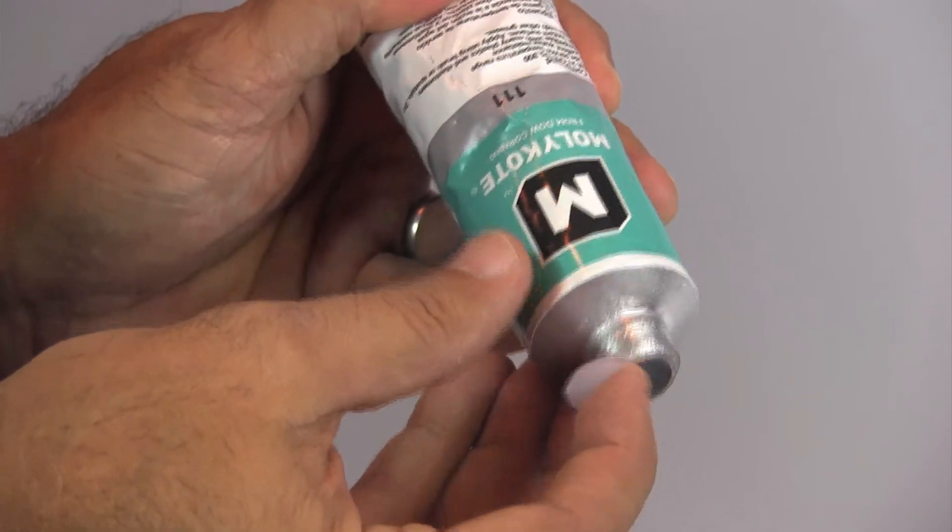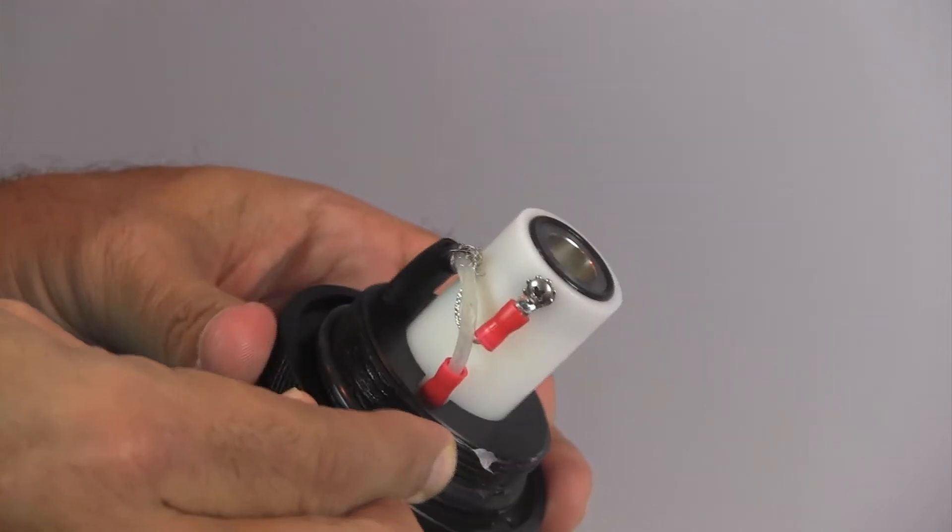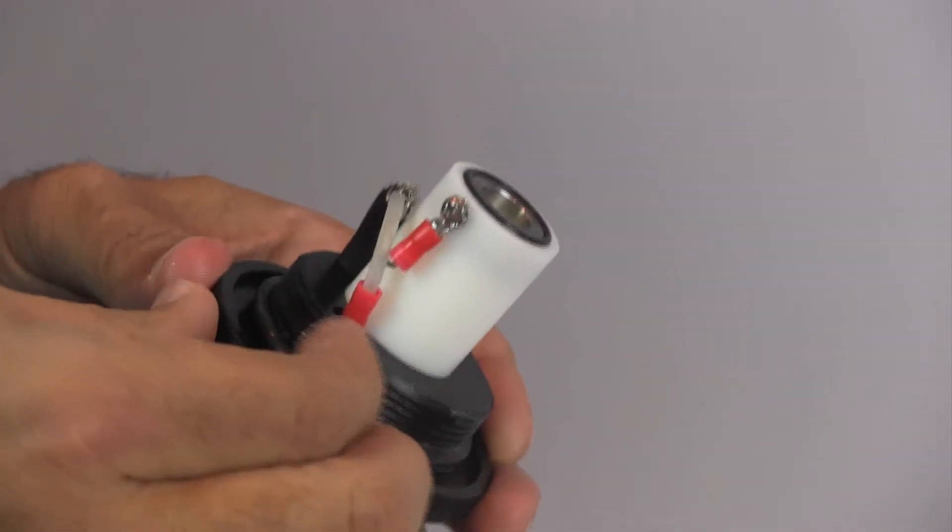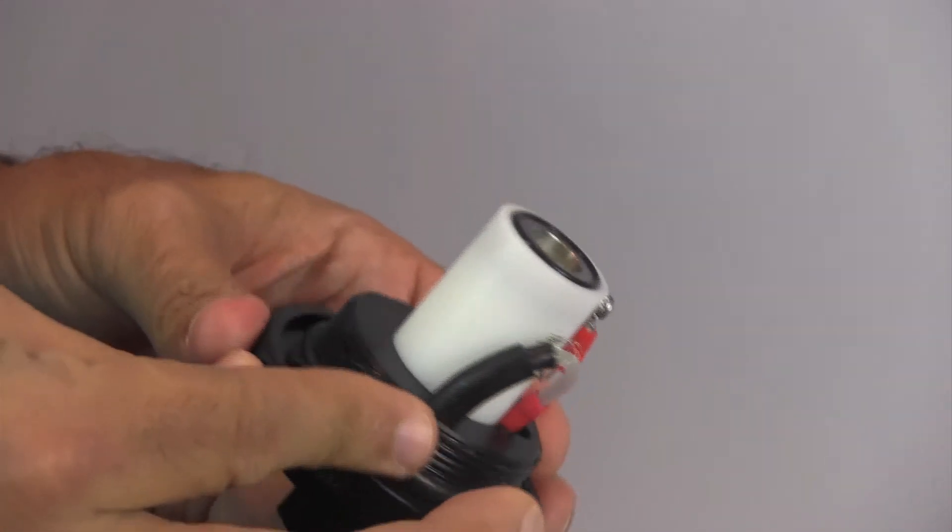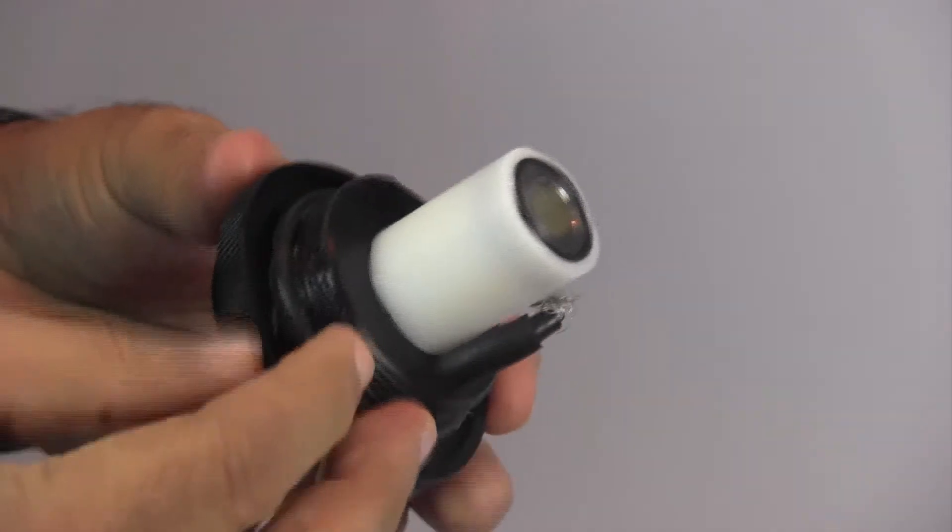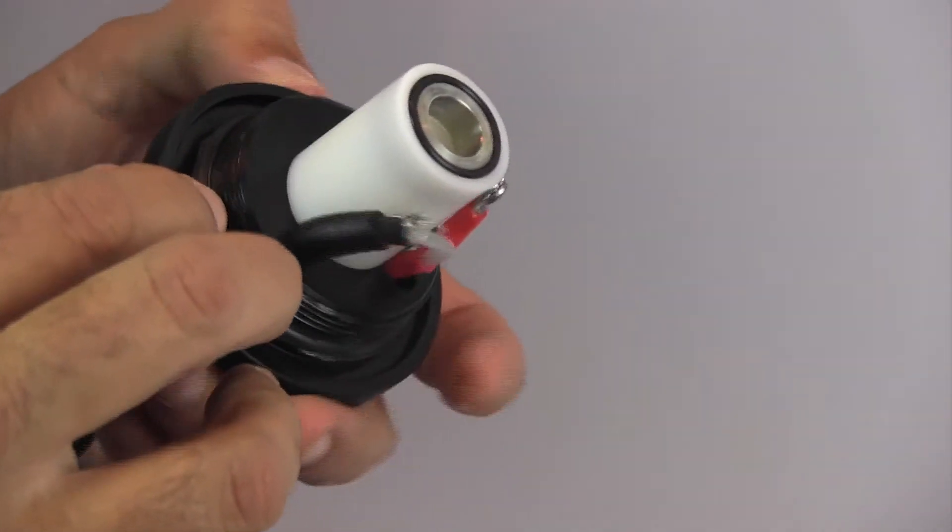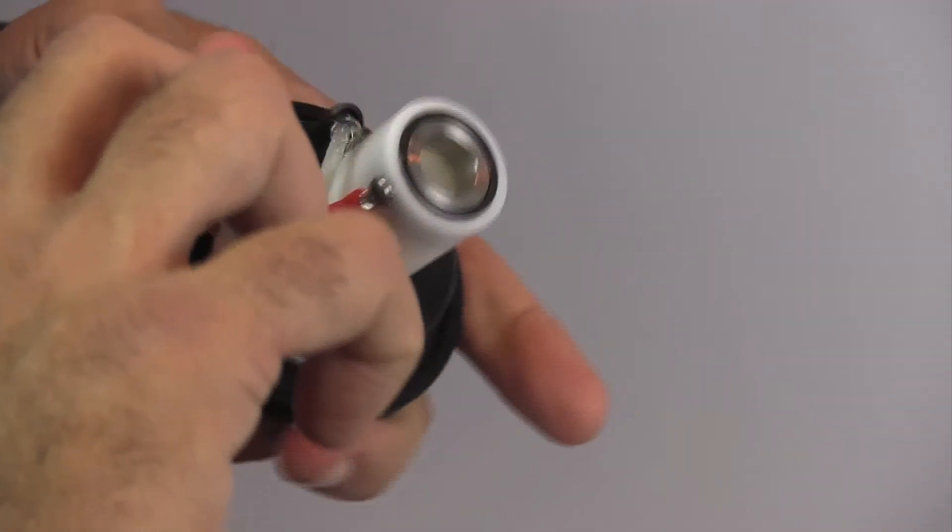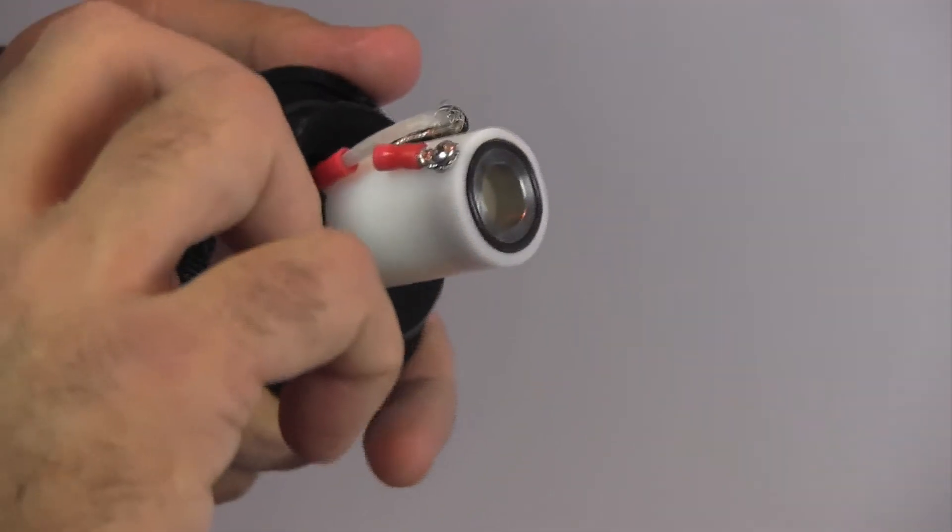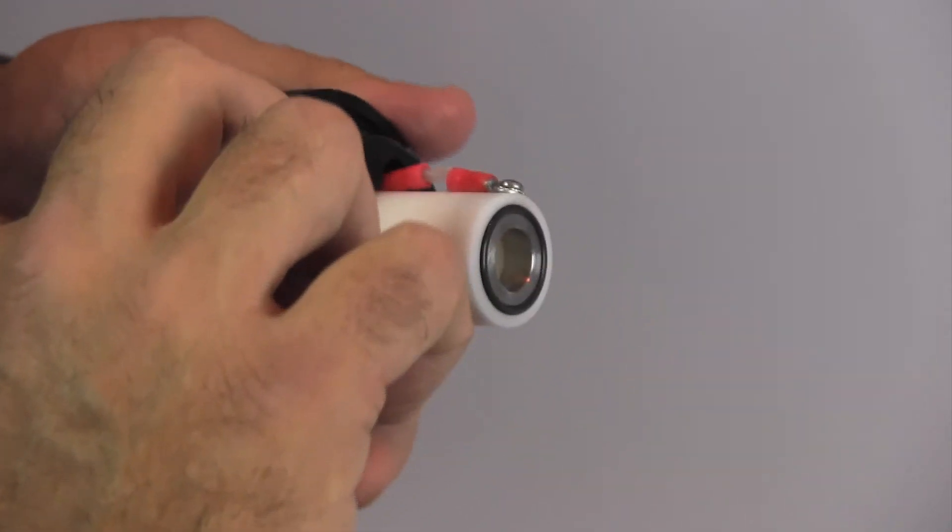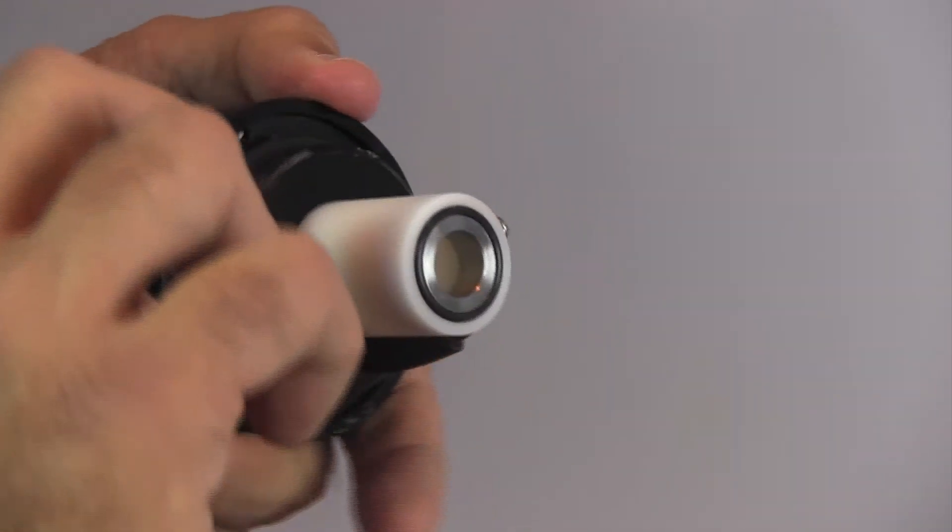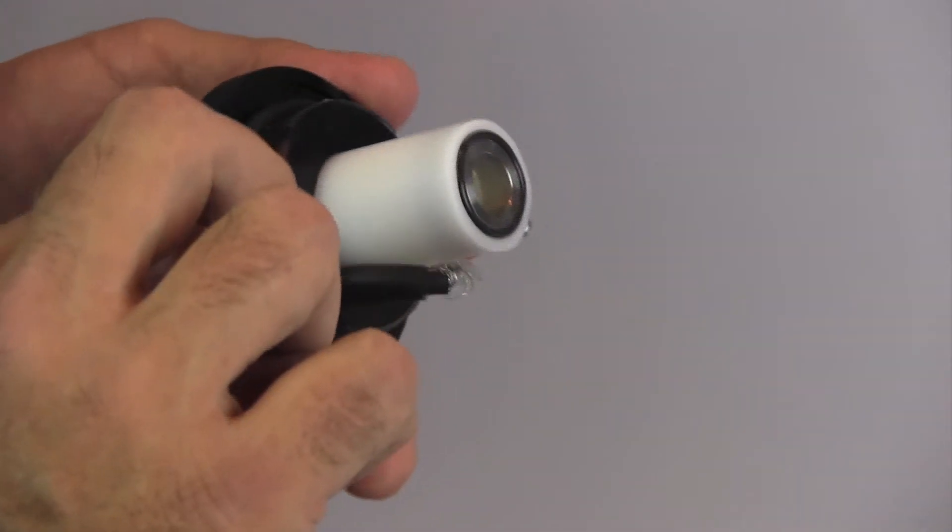Apply silicone lubricant and sealant to the threaded portion of the sensor block ring, as well as to the large O-ring at the bottom. This will complement the sensor seal, as well as act as a lubricant for later openings.